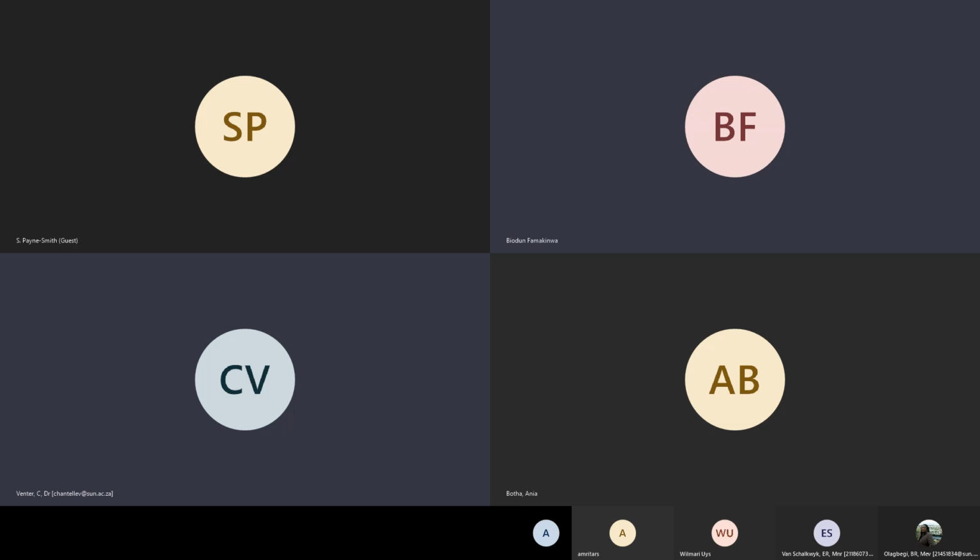The liver is always a good tissue to look at. Maybe the GIT, it depends. Then you can do normal H&E or wax embedding and then H&E staining to see if there's an effect.